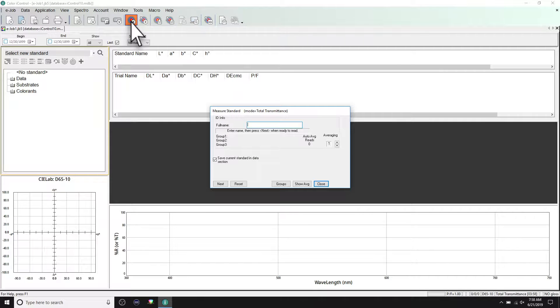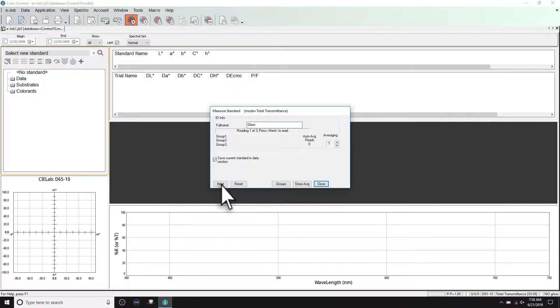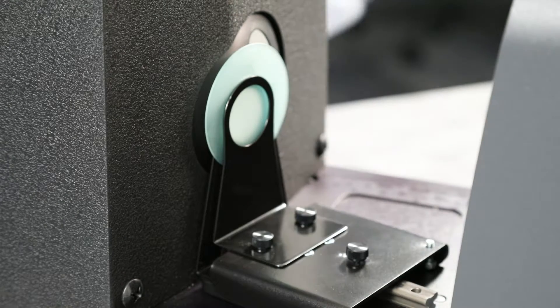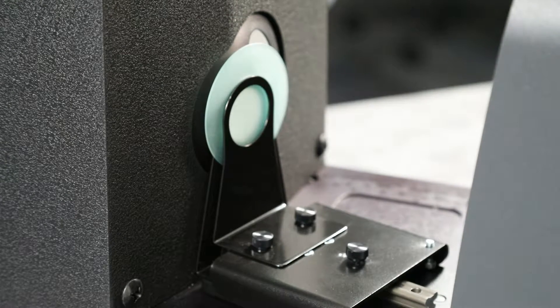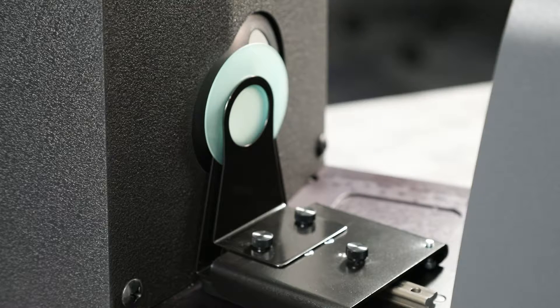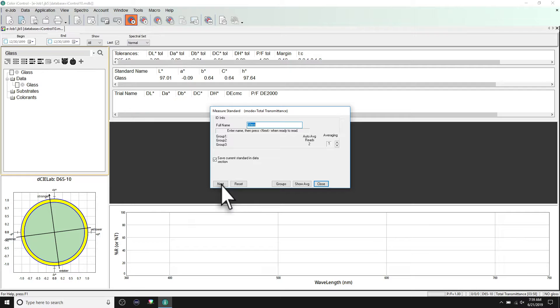Initiate a standard or trial measurement through your software and give it a name. Averaging can also be set if desired. The measurement can be triggered by either clicking next in your software or by pushing the button on the front of your instrument. The measurement is taken and displayed in your software. Repeat this process for additional measurements.